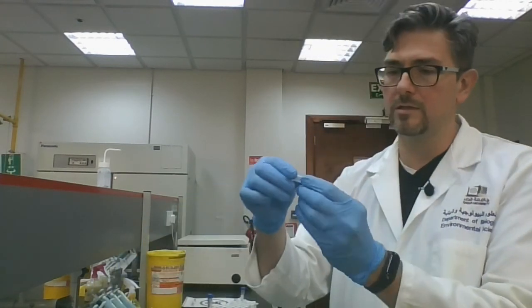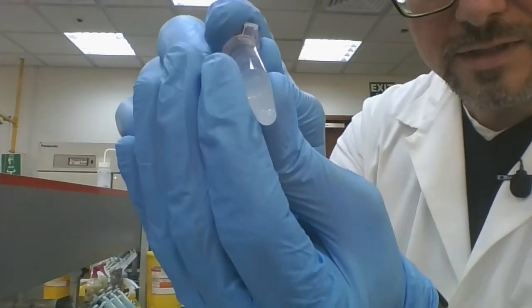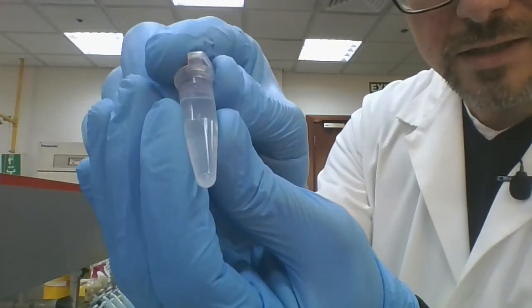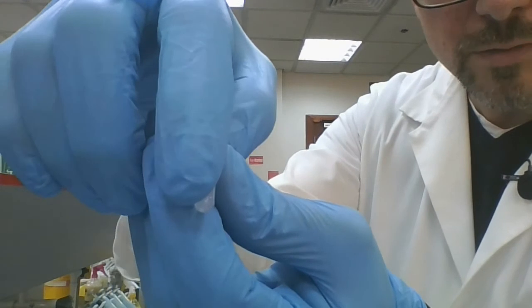Hi. So we're done with our centrifugation at this point, and we should have a DNA pellet at the bottom of our epitubes. Again, if you had your hinges pointing outwards in the rotor, you will know exactly where to look for this pellet. So let's take out our samples and take a look. Right now they are sitting in the supernatant, and there's a small pellet. I don't know if you guys can see this, but there's a very small pellet right there at the very bottom here.